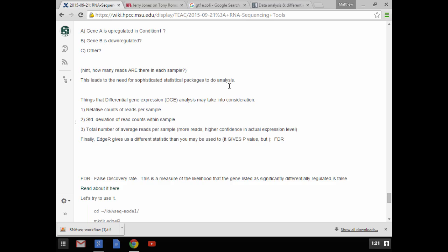So to account for all of that statistics being different, and the fact that everybody who uses p-value has been doing it wrong since the beginning of time, EdgeR and most gene differential callers don't use p-values. Let me rephrase that. They calculate the p-value and then they tell you to ignore it. So I'm going to do the same thing. I'm going to tell you to ignore the p-value.